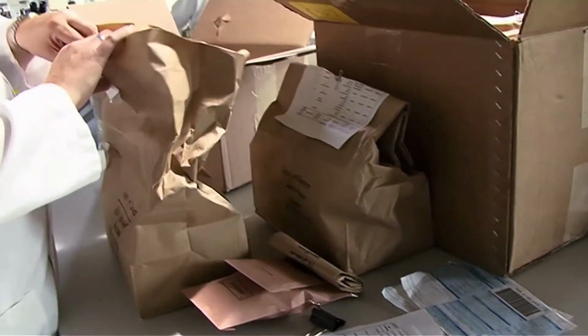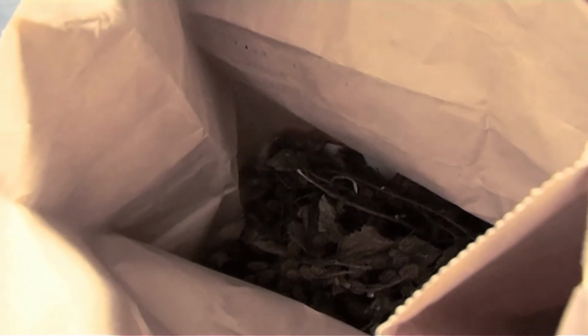We then inspect the collections to make sure they're dry and not infested. Once that is sorted out and it's quite clear that you get what is in the content and what the partners have sent over, if all that is clear, you bring the seed in this particular room. This is our dry room.